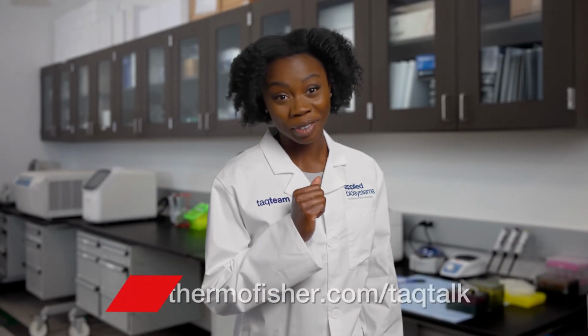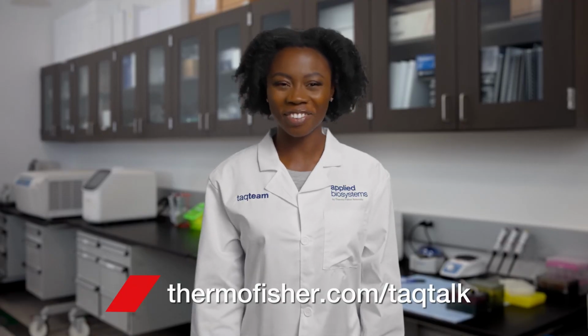Now, how do you know you're analyzing data in the geometric phase? Well, by making sure that that's where the threshold is set. Luckily for you, we have a Taq Talk all about setting the threshold.